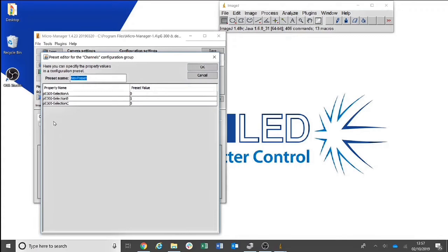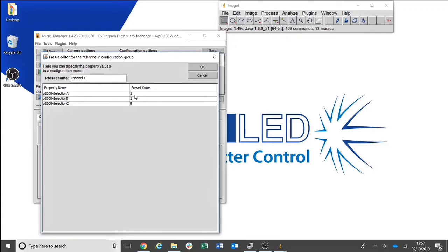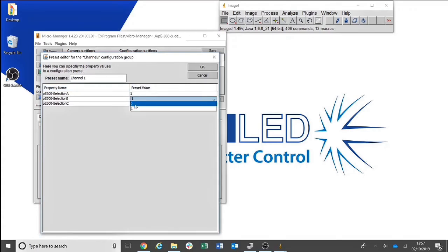Now we have the group created, we can select some presets. We will start with Channel 1. Here you will need to select Selection A as 1. This means the channel is selected. Ensure that Selection B and Selection C are 0.